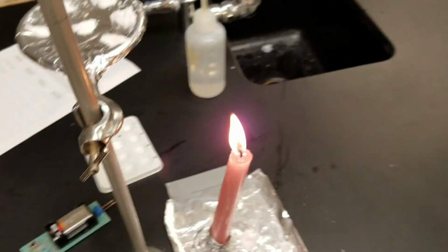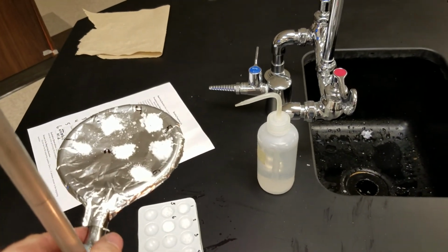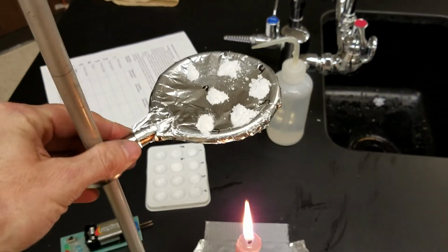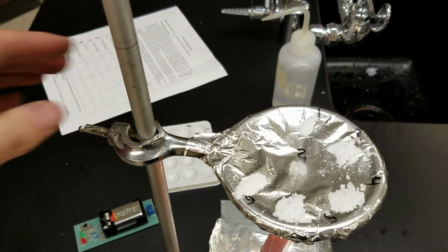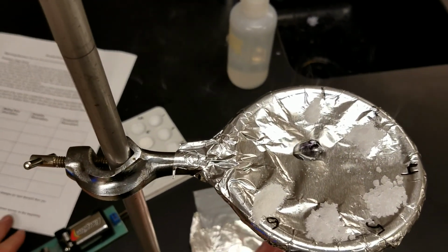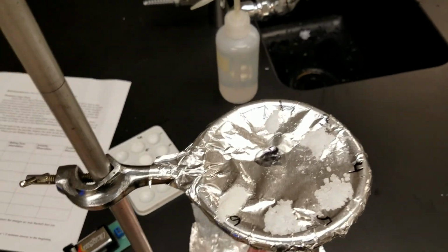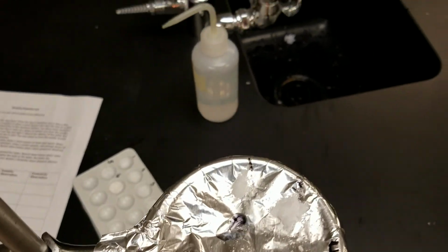So let's go ahead and get started. I'm going to move my platform right over this candle. And right off the bat, we're seeing that number 2, which is phenyl salicylate, quickly melts and bubbles.